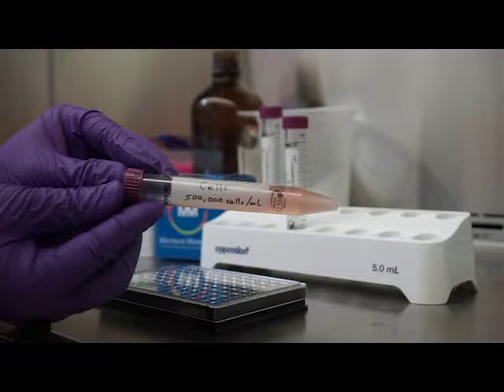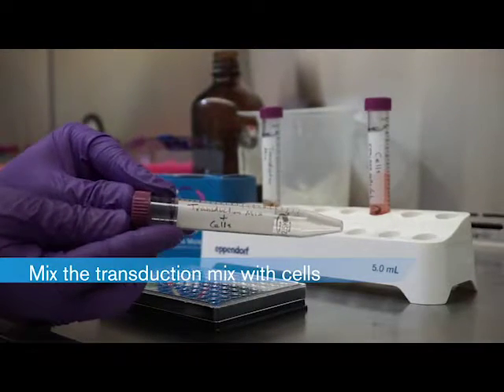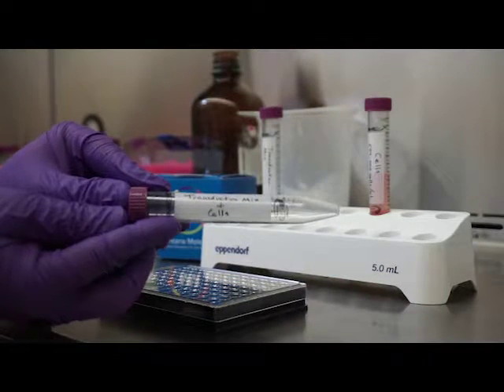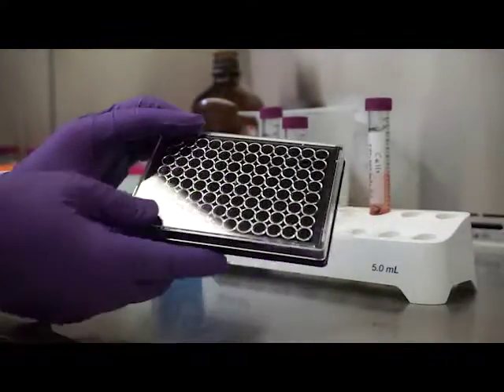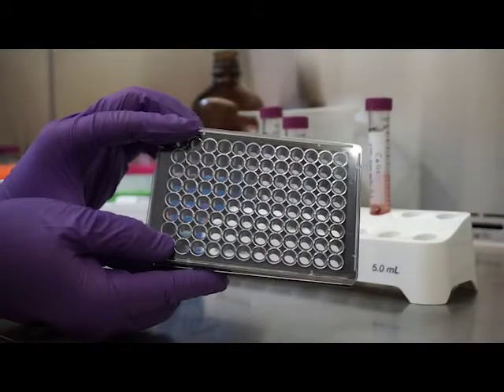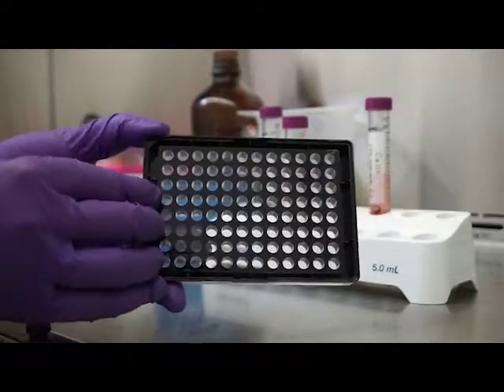Now that we have our cells in suspension and our transduction mix, we can mix these two solutions and seed the cell culture dish or microplate. On a per-well basis in a 96-well plate, 50 microliters of the transduction mix will be mixed with 100 microliters of cells, and therefore 150 microliters total will be added to each well. Our preferred plate type is the Greiner Cell Coat 96-well plate with a poly-D-lysine coating.